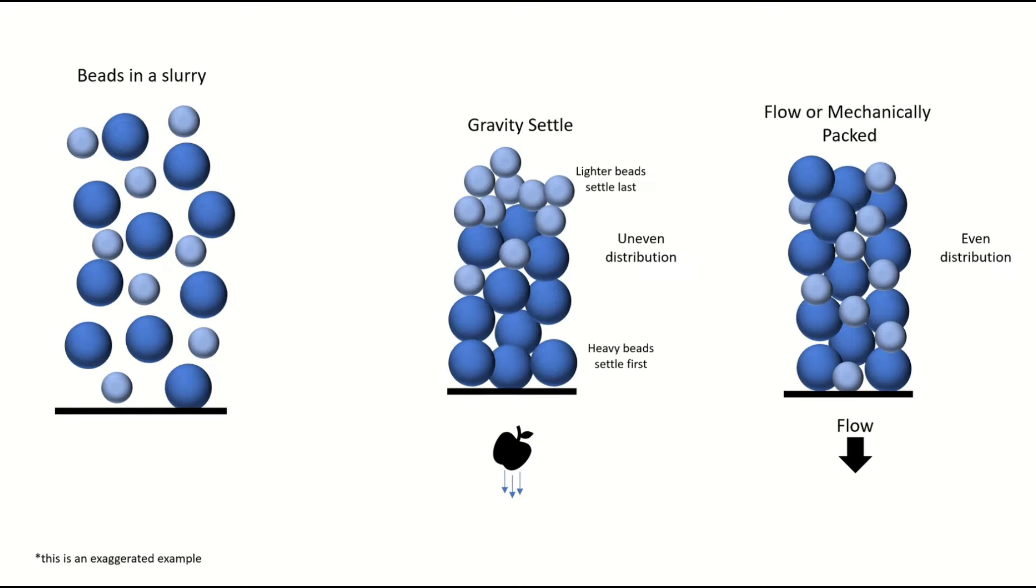Alright, I just want to say one more thing about beads floating around in the slurry before we put this column on the system and start running it. We want to avoid letting beads settle by gravity, and that's because it can cause obvious problems with uneven distribution because heavier beads will tend to settle on the bottom and lighter beads will tend to settle on the top. This can cause back pressure issues.